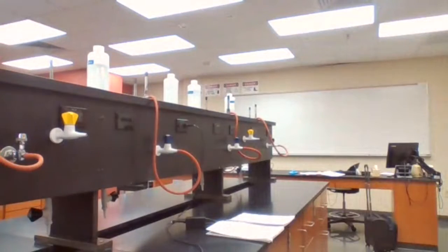So with the solid ammonium chloride, we're going to make this solution ourselves.